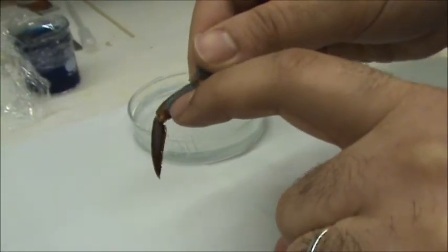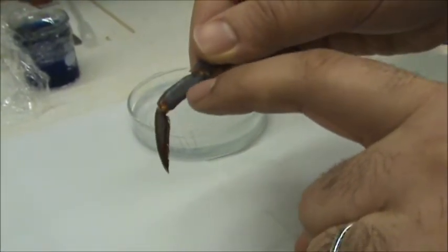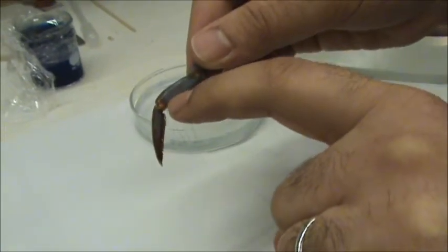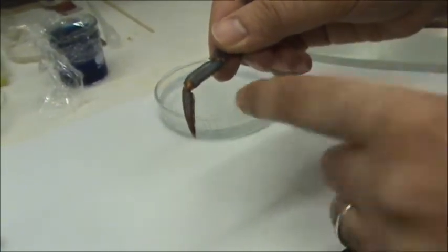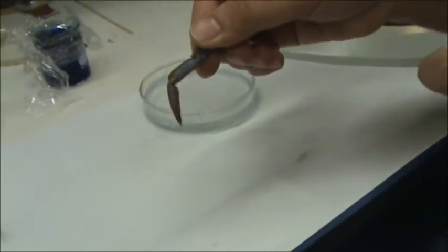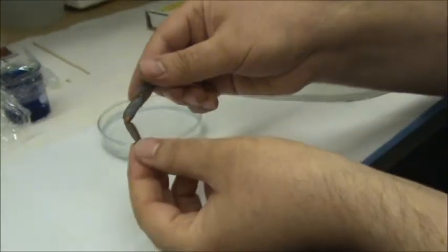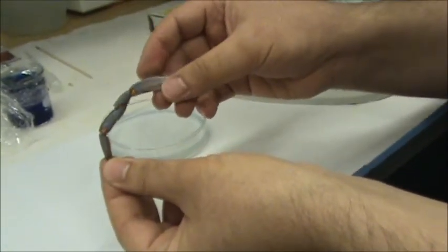The opener muscle comes with a tension nerve, and the closer muscle is located in the ventral region. We don't need the closer muscle. We should remove the closer muscle in order to see the tension nerve. Then let's do the dissection now.